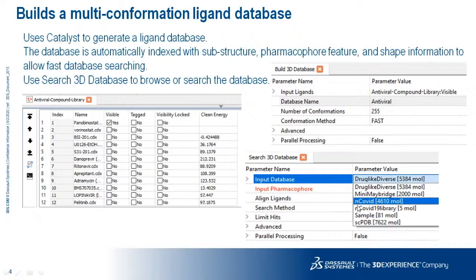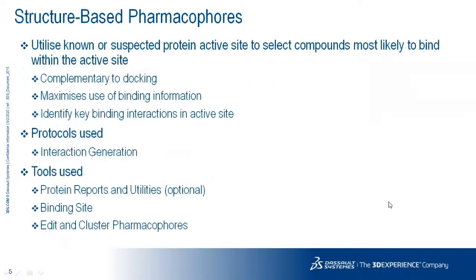Inside Discovery Studio you can see existing databases — drug-like, diverse, containing approximately 5,000 molecules — and sample compounds from the PDB database. If you want to screen with a user-specific database with multiple conformations, you go through the Build 3D Database protocol, and once done, it updates in your search database. We are using approximately 4,600 COVID molecules for our analysis. Now getting into the concept of structure-based pharmacophore — for ligand profiling, we need a structure-based pharmacophore.